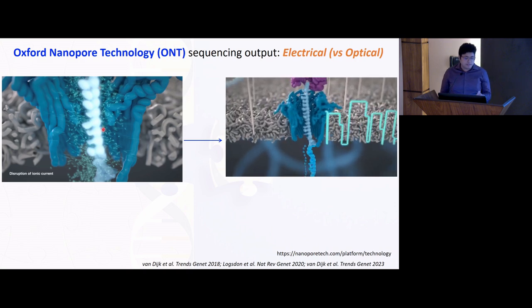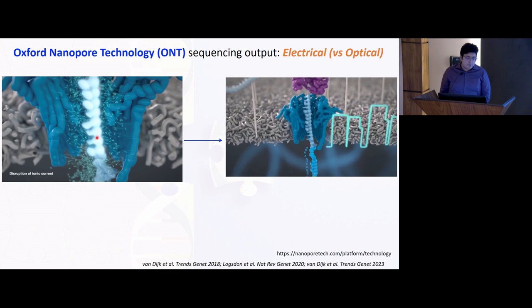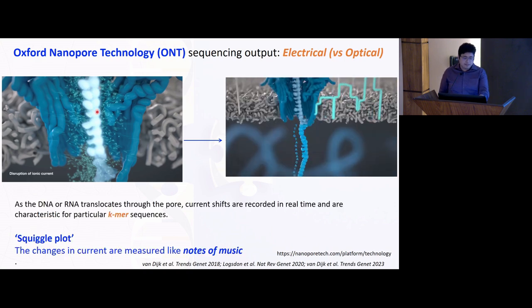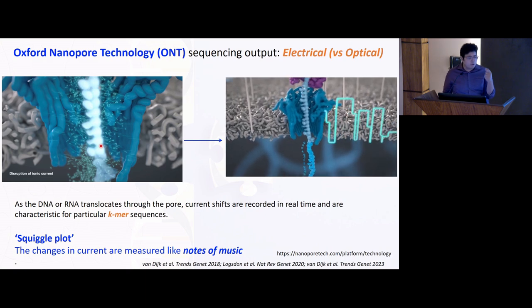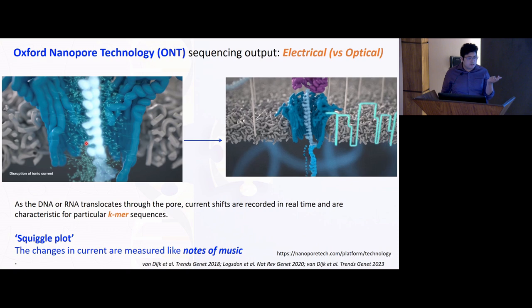So this is what I was talking to you about, Karthik, yesterday, that a k-mer sequence is read together. So what it means is, it's not only one nucleotide. We are reading these 1, 2, 3, 4, 5, 6, 7, 8 nucleotides at one point of time. So the smaller you can make the sensing region, the more accurate your reads are going to be, right? So the current chemistries have come up with smaller sequencing pores.